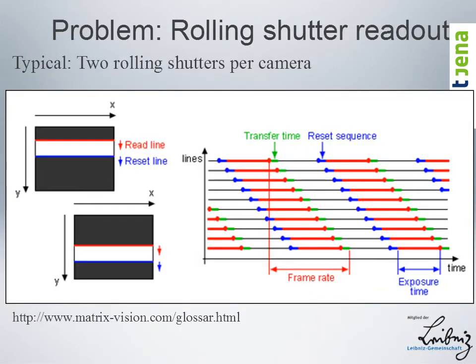So one of the more recent advances was where we thought about how to deal with the current very fast camera technology, which was becoming the bottleneck in our experiments. And this can be done. These cameras have what is called a rolling shutter. This is in a way very incompatible with structured illumination, where you always need to acquire whole images at once. And the rolling shutter basically says start integration here, and it sort of flows downward.